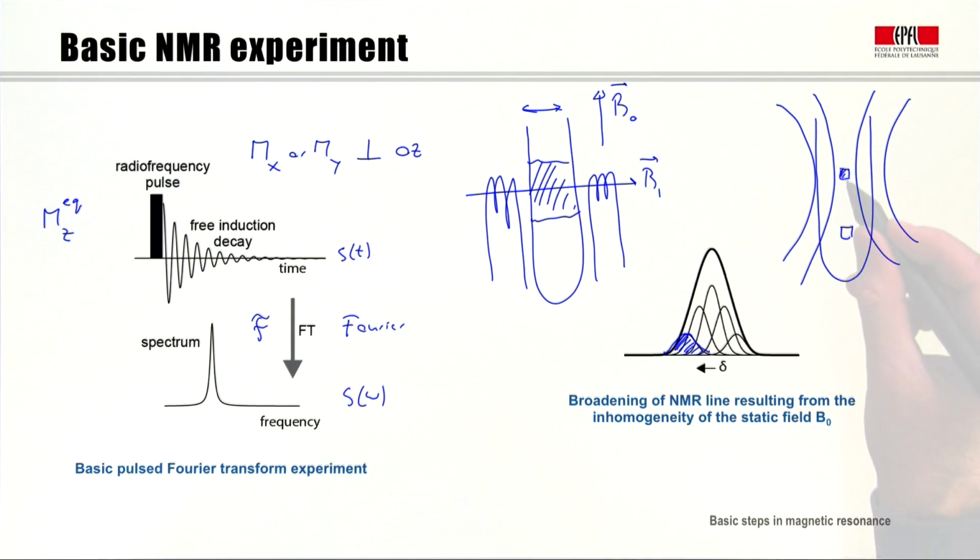So this here will stem from this voxel here, whereas this voxel, which is exposed to a less intense magnetic field, will give rise to a somewhat lower frequency. And clearly, because there are many voxels, we have a distribution and a resultant line shape, which in fact can be described by this width here. Now it turns out that the width of the field-independent component here, that is the inherent width or the true width, is known as Δν, and it is the inverse of πT2.